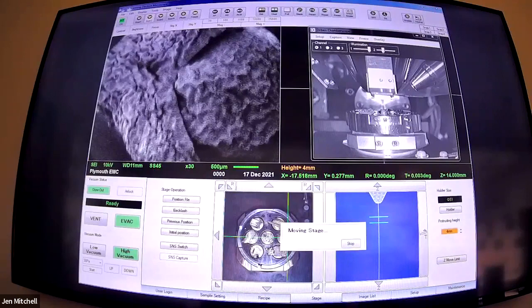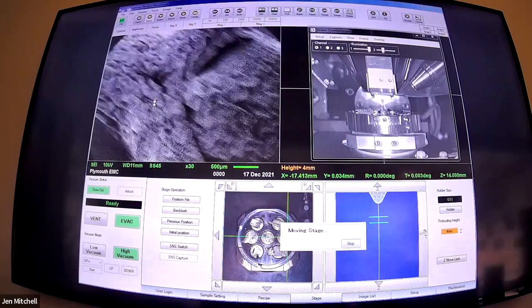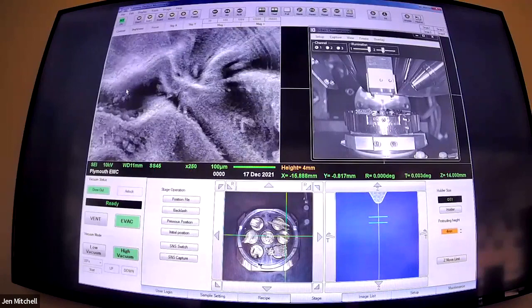This is kind of like the top end of the clove - this is where the flower is, the little bobbly bit at the end. It was a flower. It is upsettingly wrinkly - it never occurred to me, of course it is, why wouldn't it be? Well, it's been dried, so when you think about it it makes sense, but it's still upsetting to look at.